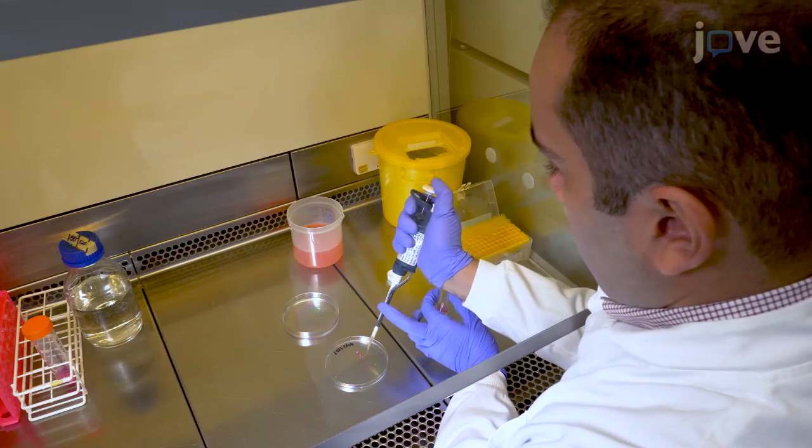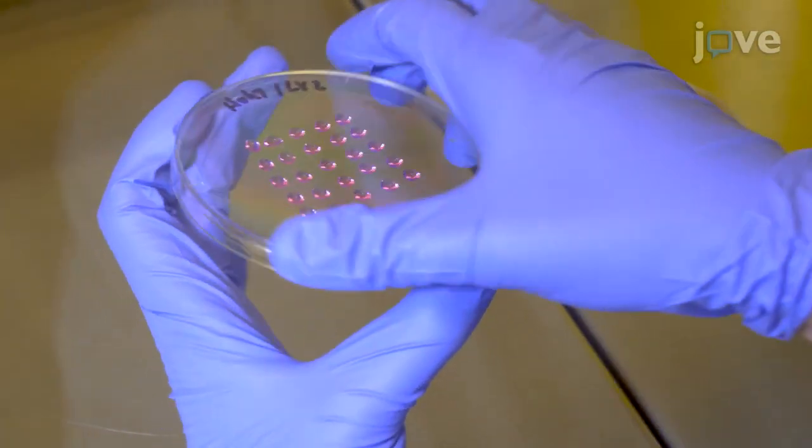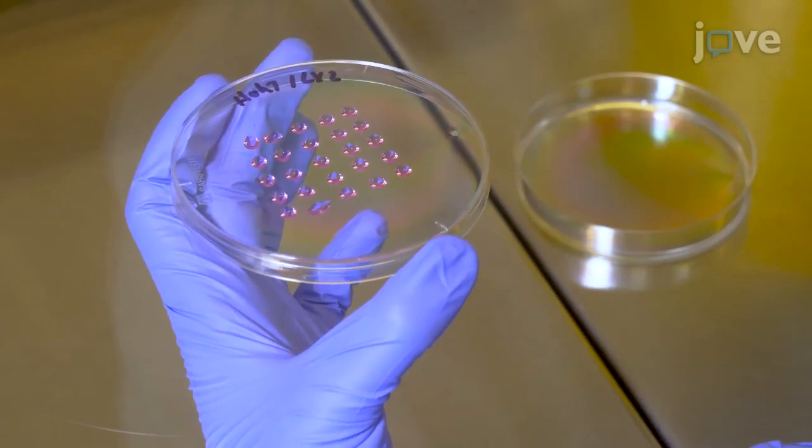3D tumour spheroids have replaced the conventional 2D monolayer technique as the gold standard for in vitro cancer research. These models permit the co-culture of multiple cell types, which reflect the heterogeneity of the tumour microenvironment and allow the exploitation of spatial interactions. Advantages of using the hanging droplets method to generate 3D spheroids are the lack of cell-plastic interaction and the ease of studying the interaction between the tumor cells and the non-tumor cells.